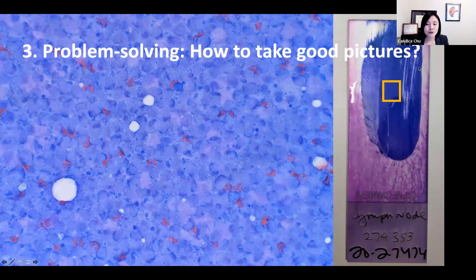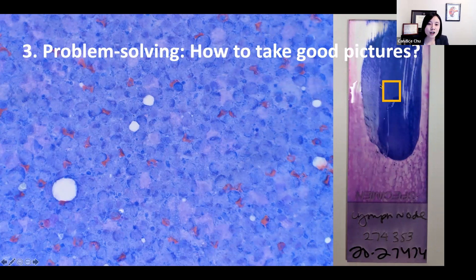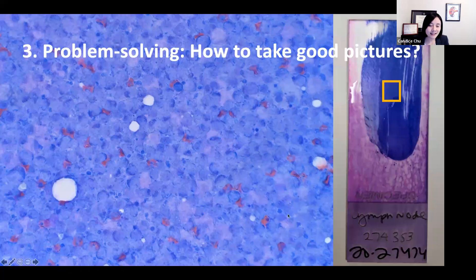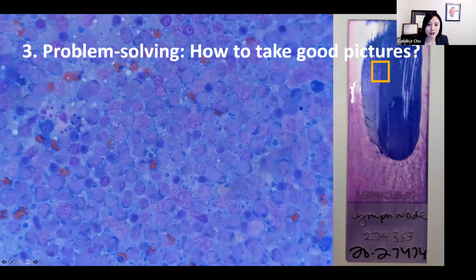This is very blue, so you know that the smear is hypercellular. However, if you jump right into the middle of the smear, this is what you will be seeing. This is too crowded and I can't even appreciate the individual cells.